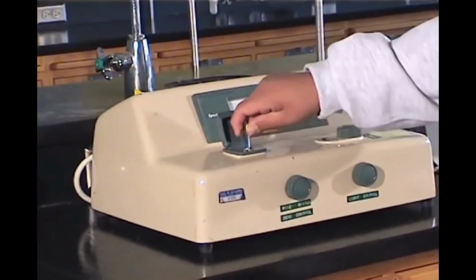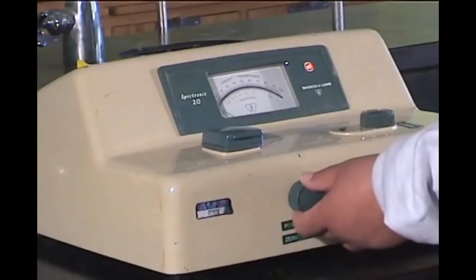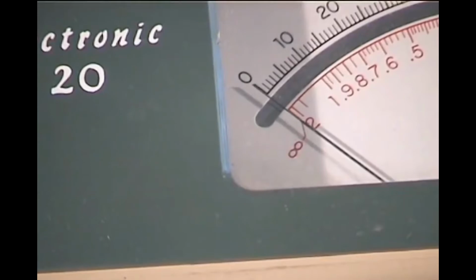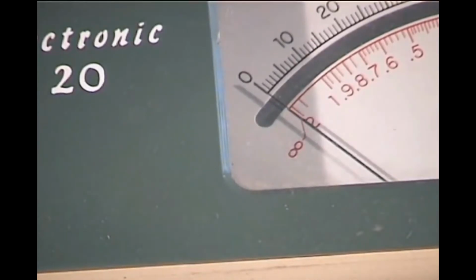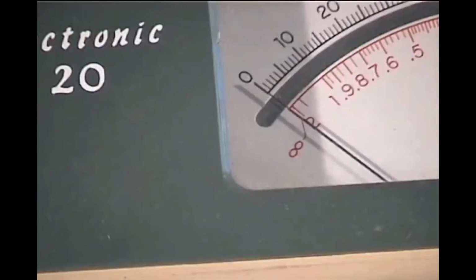Now we remove the cuvette from the instrument and close the top flap, and use the dual-purpose on-off knob to select 0 transmittance, or infinite absorbance. We repeat this process until the meter does not drift. We get 100% transmittance with the control cuvette inserted and 0% transmittance with no cuvette in the instrument.